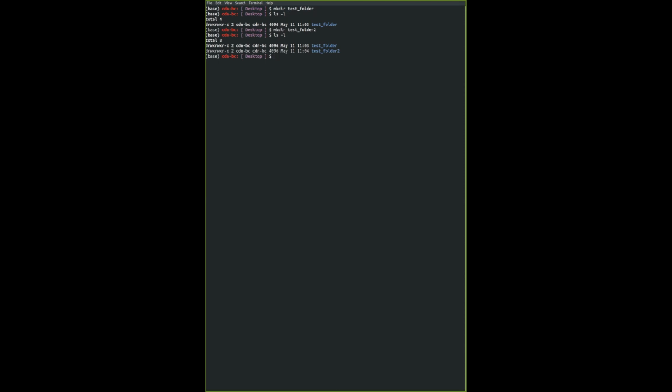You can create subfolders. So within any of these folders, you can create another folder within this folder. And you do that by, again, the way you specify path, you specify the name of the new folder that you want to create, following a /. So inside test folder, I want to create a new folder within this test folder, and I will name it subfolder. So again, what does this mean? Within test underscore folder, create a new directory called subfolder. And I'm going to press enter.